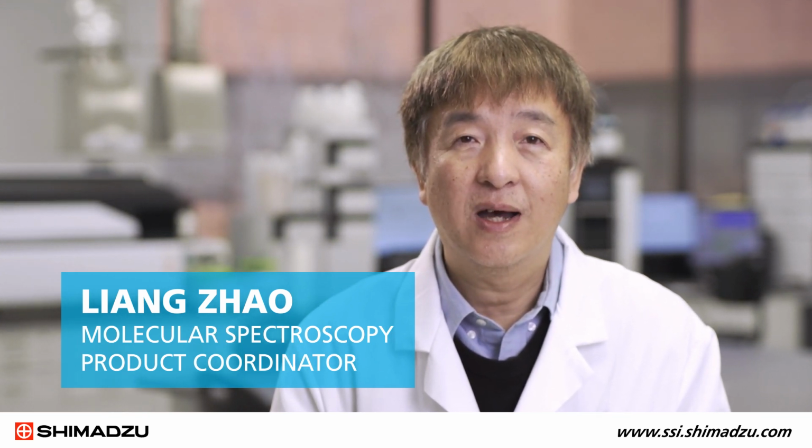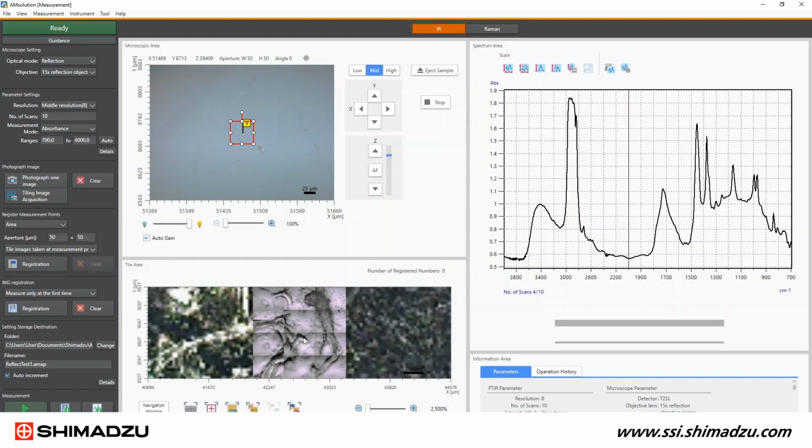In this video, I will show you how to use the mapping software to carry out IR or Raman spectra of microscopic samples with the AIRsight microscope. The mapping module is an important option for the AMsolution software that is used for instrument control and data analysis of the Shimadzu FTIR or Raman microscope.